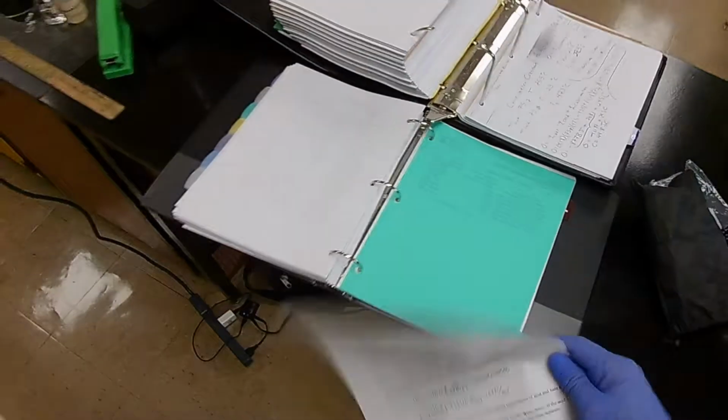The calorimeter constant, in fact, the method, the document that you'll follow, it's in Blackboard, and at the bottom of this first sheet is a sample calculation to determine the calorimeter constant. So let's talk about that. What does that mean?